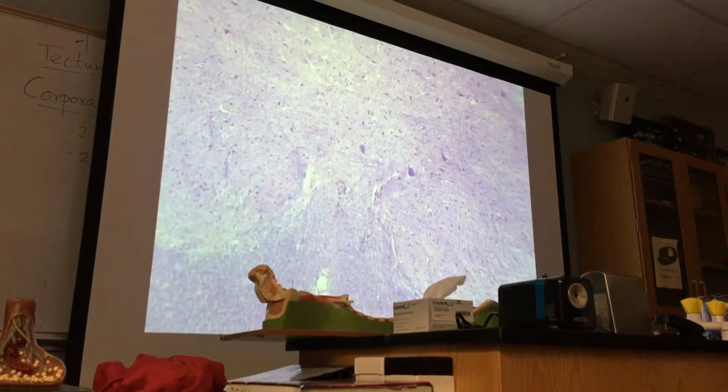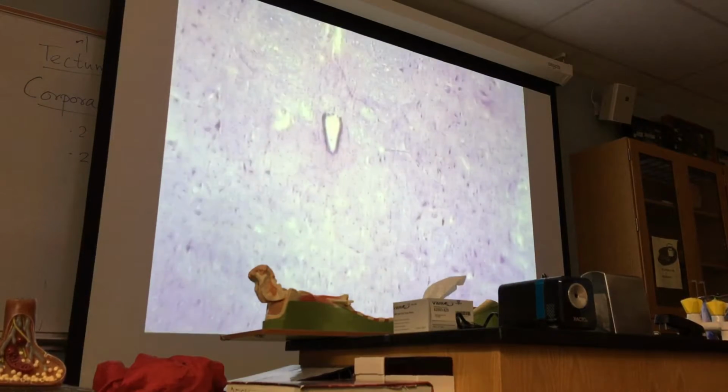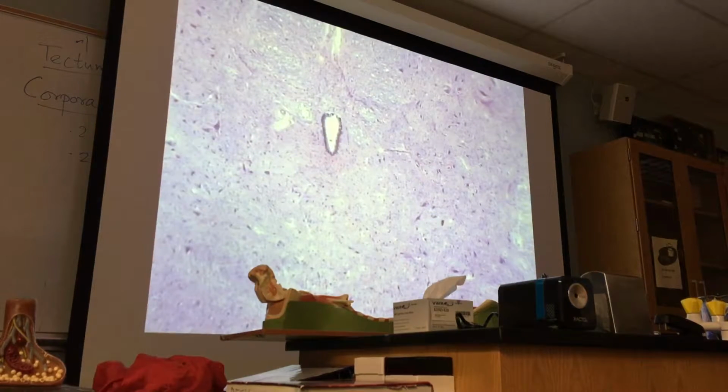Still here, this is all gray matter, and this is white matter. So this is the posterior side or the dorsal side. It's not thin enough, but you know, in this region a little bit of depression is there, and this is very shallow. You can draw an imaginary line from there, and that line will be called the dorsal median sulcus.